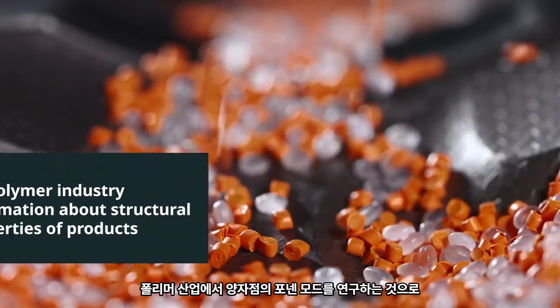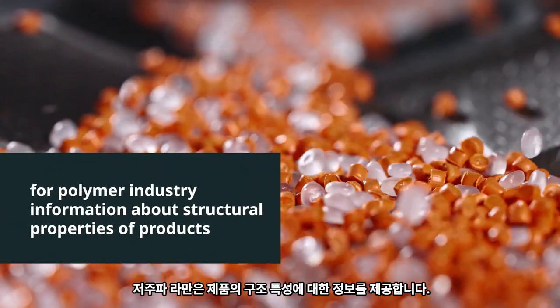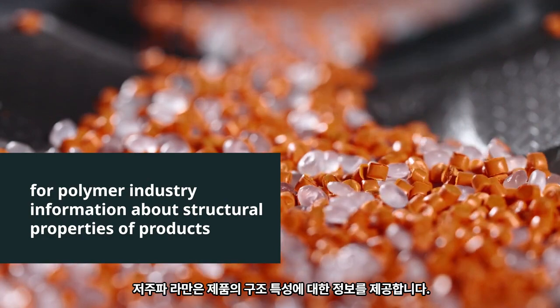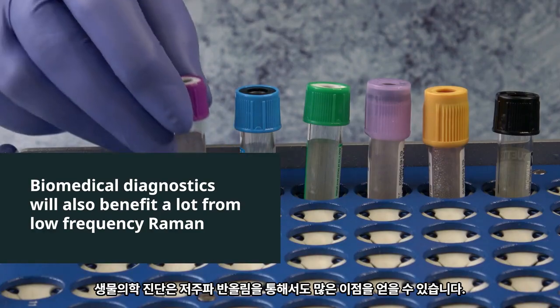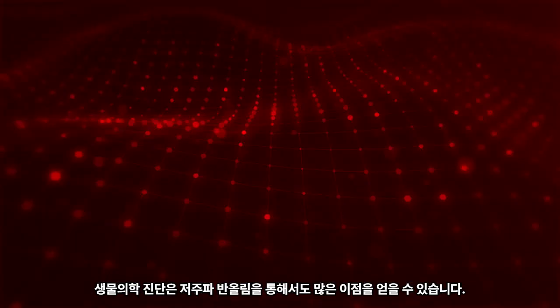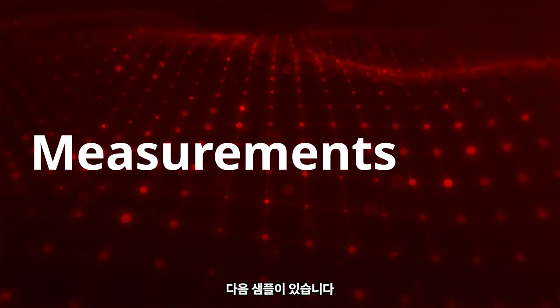In the polymer industry, the low-frequency Raman will provide the information about structural properties of products. Biomedical diagnostics will also benefit a lot from low-frequency Raman. Now we'll do some measurements. We have the following samples.